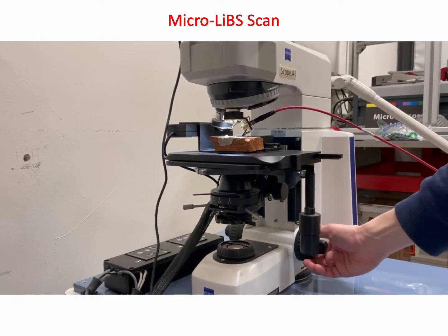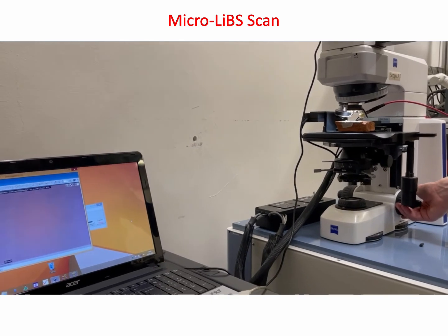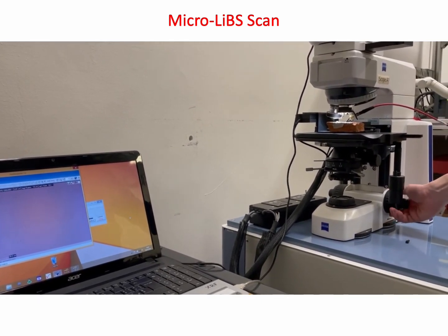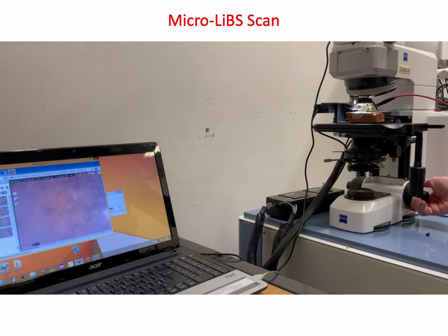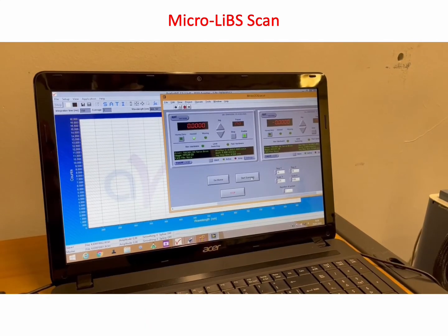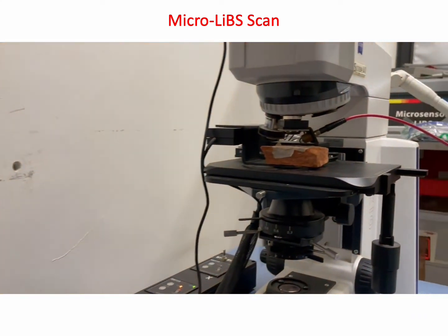So, after adjusting the fiber optics, we have to adjust the focus position as well. So we are finally ready to realize the maps.